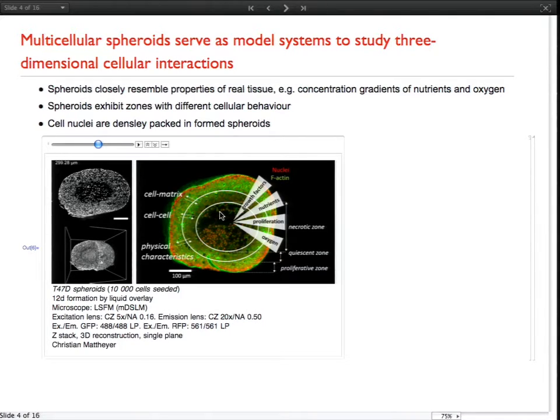But we are not two-dimensional, we are three-dimensional. People have found out that to actually study cell interactions in 3D, you get different results, and you also get different results from drug testing if you do it on 3D spheroids instead of these 2D tissues. So far, what most people do is they have the spheroid, and then they put a drug on it, and they see whether it shrinks or not.